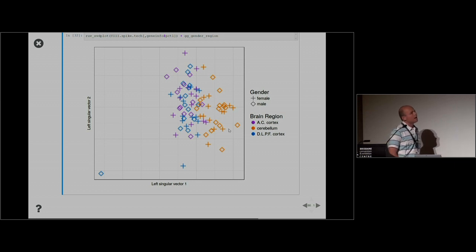Okay? What this is starting to get at is the important point that in any analysis, it's in some sense up to you what is wanted and what is unwanted. Depending on the goal of the analysis, certain things might be wanted, other things might be unwanted. So here we've done a very good job at removing the purely technical variation, but we still have what might be considered in some cases as unwanted biological variation.